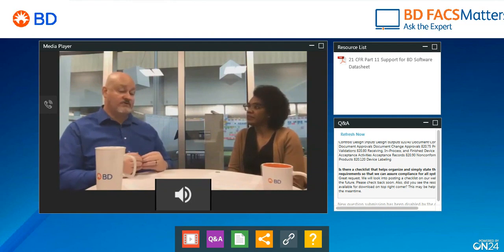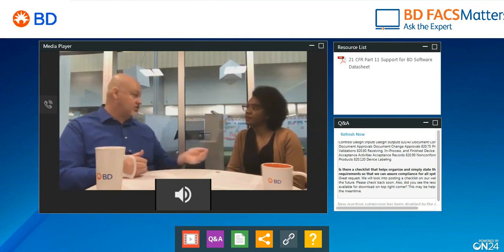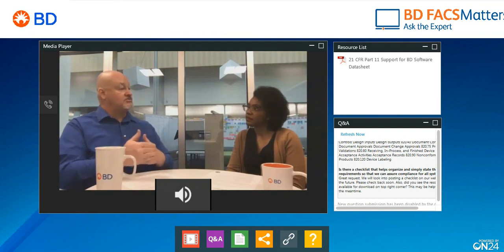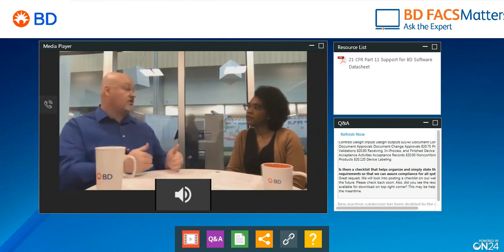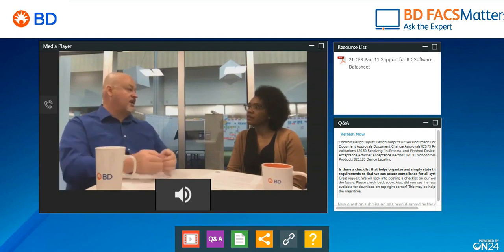So portions of the regulation can be met through functionality of a software application. Those are the ones such as security access. You can implement software controls to provide security access. But there's other controls that are procedural that says your company will have a procedure for document control. That's something that the application can't help with. So there's specific procedural requirements in Part 11 that are not applicable to the software applications we're using.